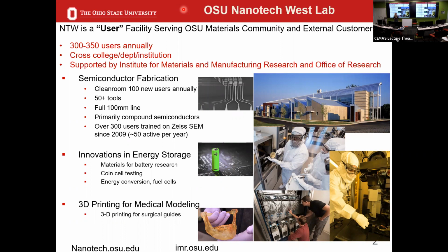A lot of what we do is compound semiconductors. So not silicon. So we're not Silicon Valley West. We do a lot of compound semiconductor materials. And then just for the electron microscopy folks, we have trained since its installation about 300 users on our Zeiss Ultra Plus SEM, which is located in the clean room, about 50 per year. So again, these are not microscopists.